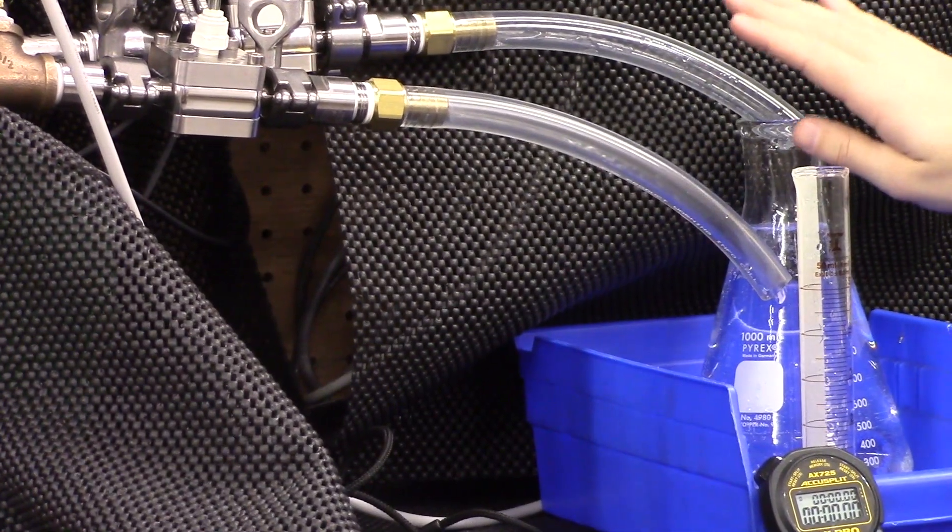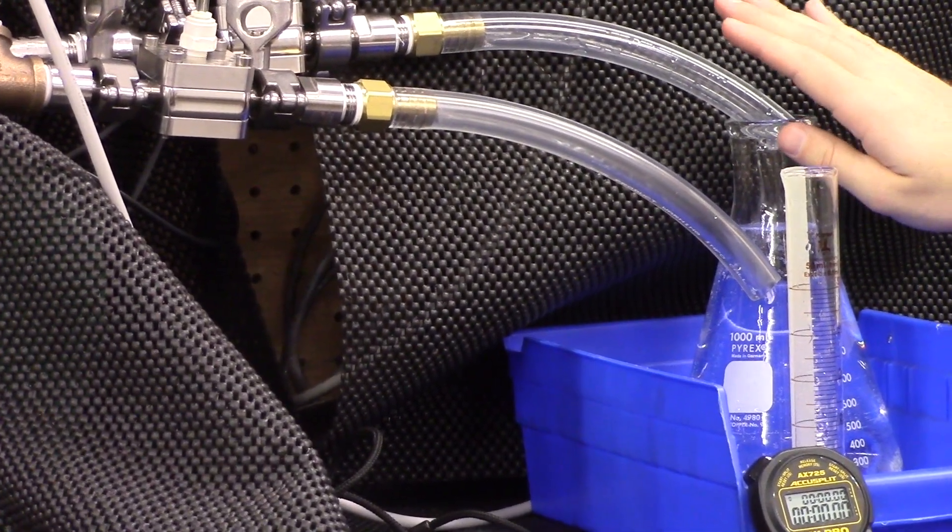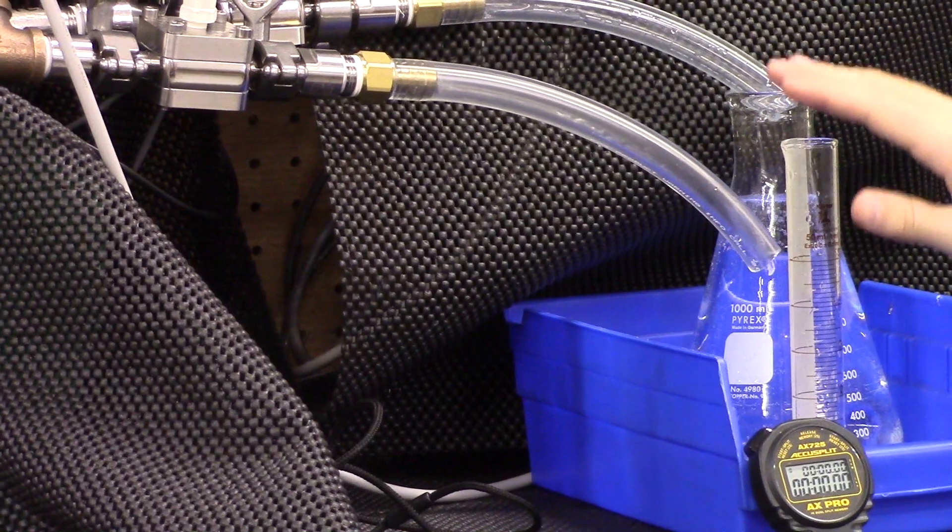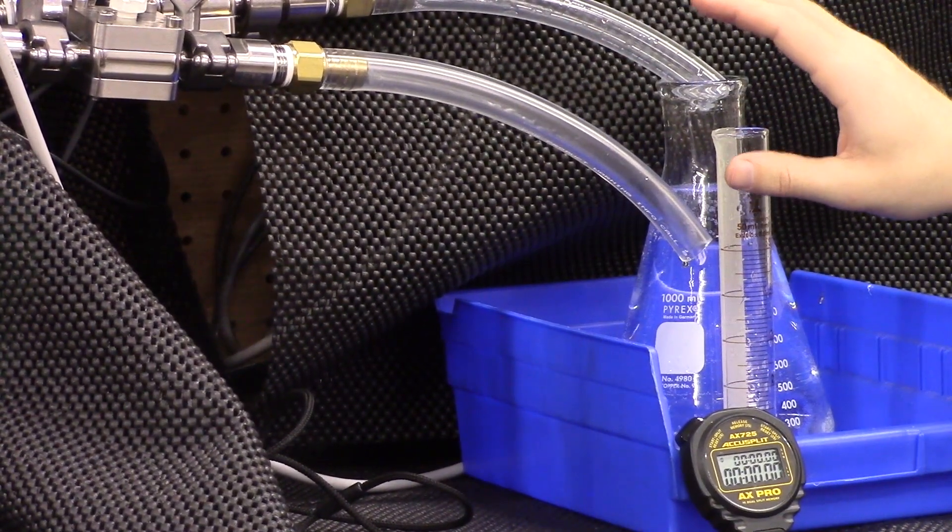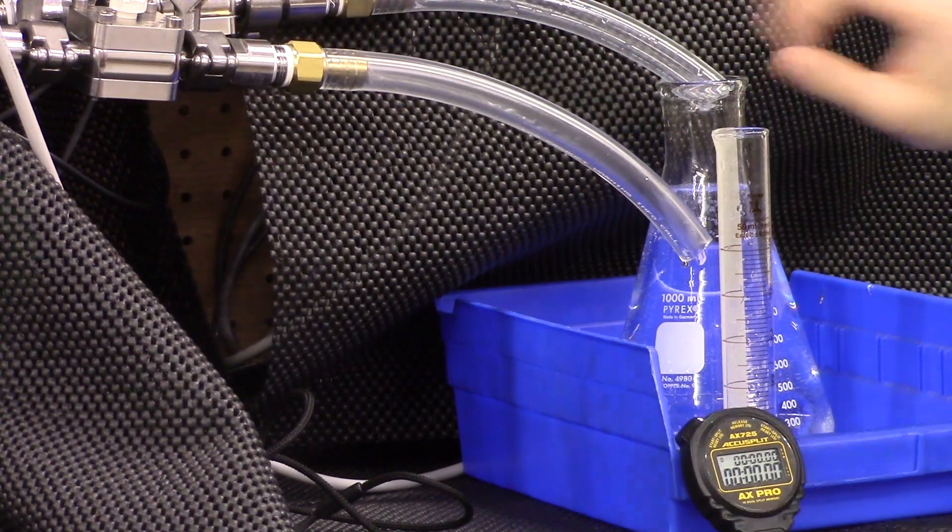So in one regulator, we're going to look for a 1000 milliliters per minute flow rate. And then in the other back pressure regulator and flow control system, we're going to look for a 10 milliliters per minute flow rate. So we will go ahead and start the system up now.